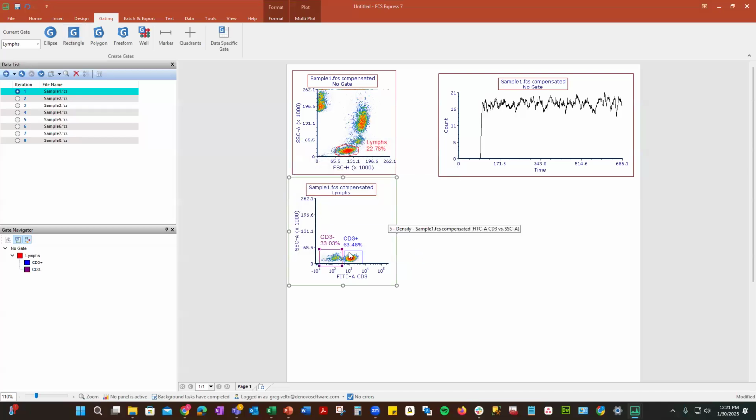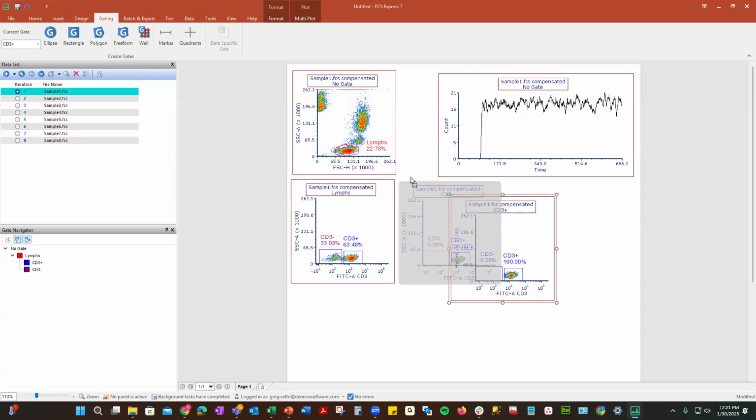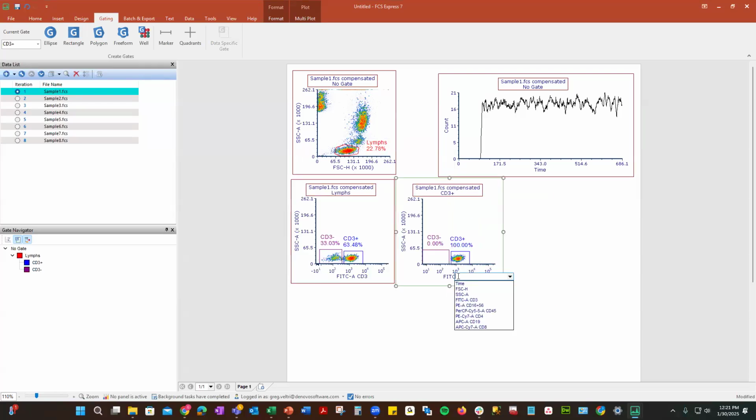So now we have some statistics there, and let's do another plot. And let's do 4 and 8. So we'll look at our helpers and cytotoxic cells and see what we get on this. All right. So there's a couple of things that you can do within FCS Express that will help you analyze and show your data better. So you'll notice that this particular sample didn't have a lot of CD4s to see. The negatives are kind of, maybe there's some CD8s there.